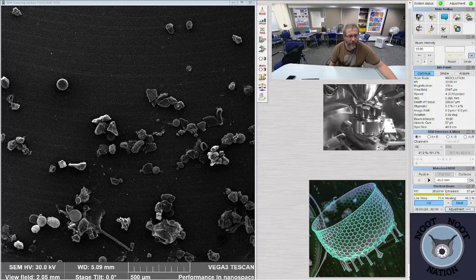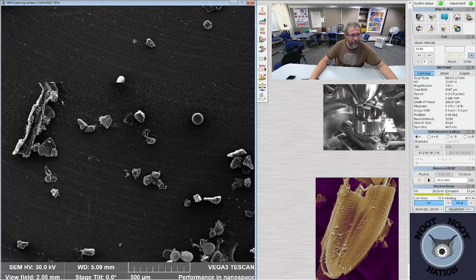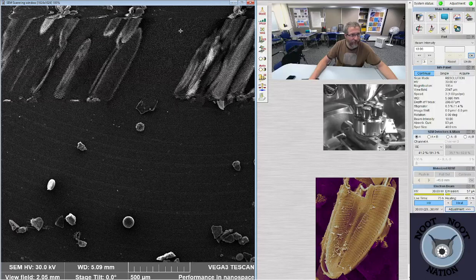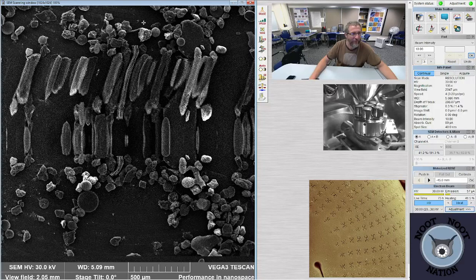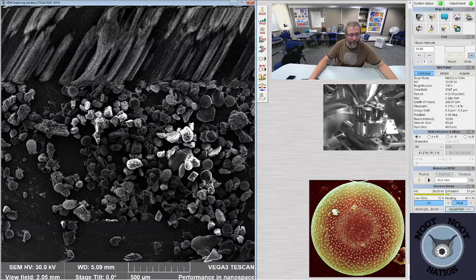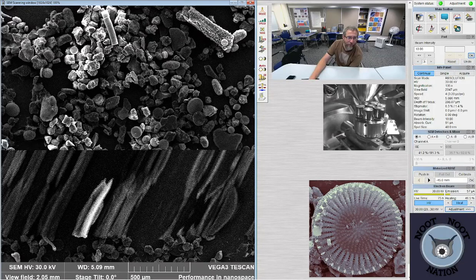Goliatom, yeah, it's huge. In a single cell as well. We talk about this pretty regularly on Pacific Plankton Stream. How you can have something that's 300, almost 400 microns across, and it's a single cell, and then, you know, swimming next to it, something smaller that's a multicellular organism. That's kind of a neat aspect of looking at things that are this tiny, is that some of these things are monstrous, but just one cell, and some of these things are tiny but multicellular.